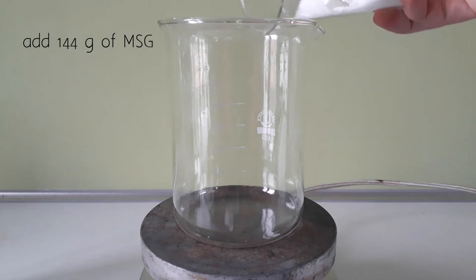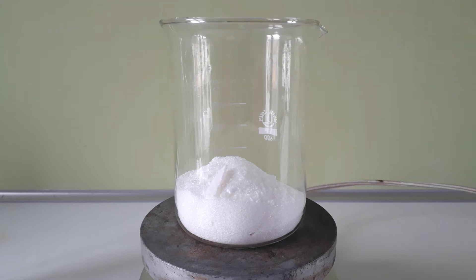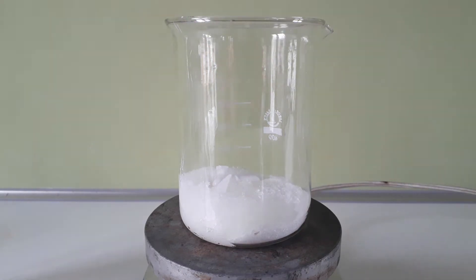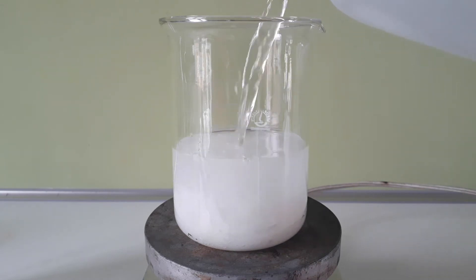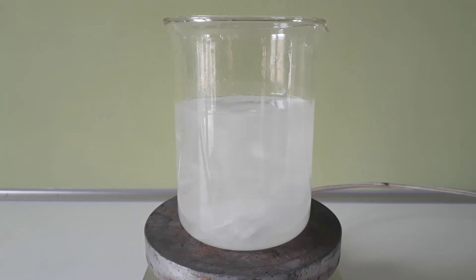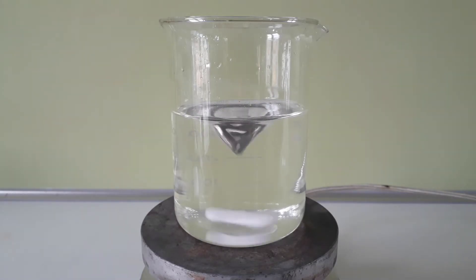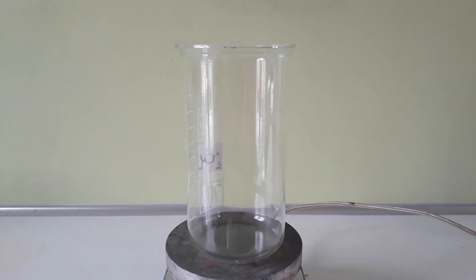To start off, I dissolved 144 grams of monosodium glutamate in around 400 milliliters of water. This takes a while since the solvation of MSG is quite endothermic; nevertheless, MSG is actually quite soluble in water. After it had all dissolved, I replaced the smaller beaker with the larger one and transferred the MSG solution to it. I obviously should have used the larger beaker in the first place.